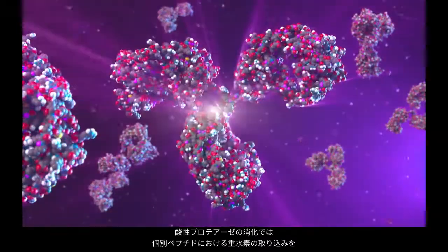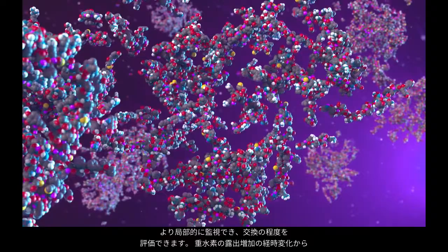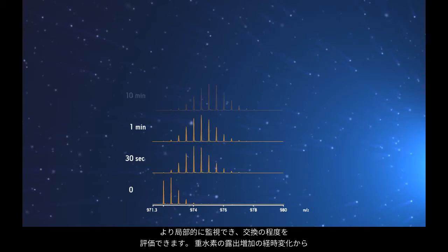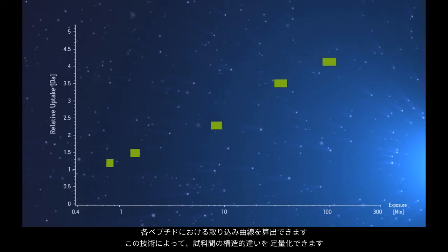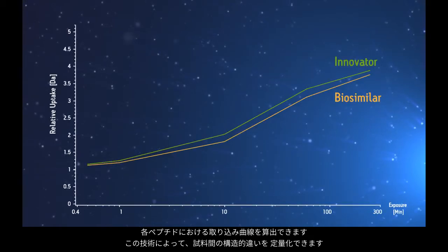Acid protease digestion allows us to monitor deuterium uptake at a more local level on individual peptides and assess the degree of exchange. A time course of increasing deuterium exposure allows us to calculate an incorporation curve for each peptide. This technique allows us to quantify structural differences between samples.